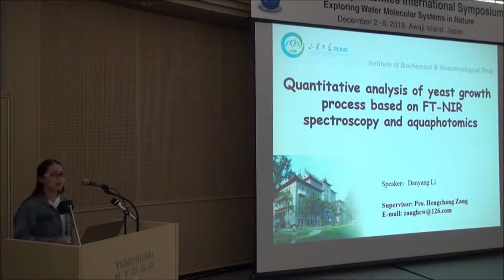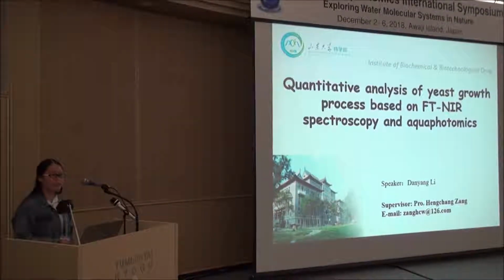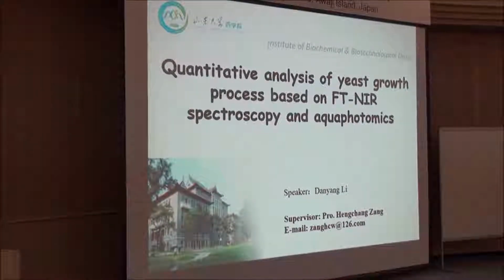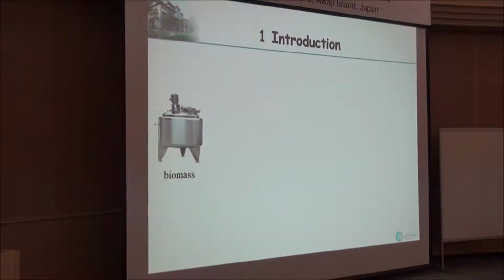Hello everyone, my name is Danyang Li from Shandong University. Today my presentation title is Quantitative Analysis of Yeast Growth Process based on NIR and Aquaphotomics. Biomass is an important parameter for selecting the termination time to maximize the production.